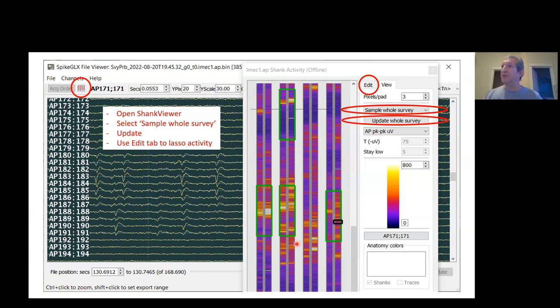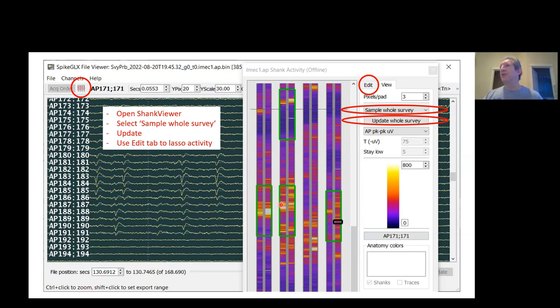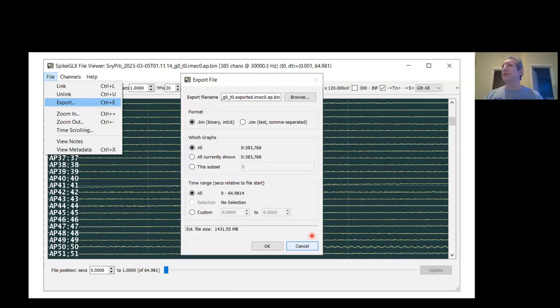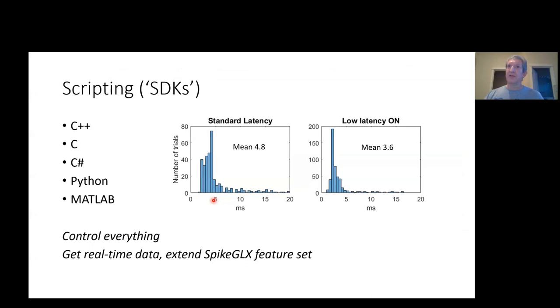I talked about a special survey type of run. If you open that with the file viewer, now you can hit the shank viewer here. You can select sample whole survey and click Update, and now you'll see an integration of all the activity on all of the banks of the probe painted all at once. So you'll see where the activity is on the full length of the probe, and now you can lay down boxes on top of that activity. This is super useful. Also in this viewer, there's an export feature where you can export a subset of a full file, choosing just the traces that you want or the time range that you want.